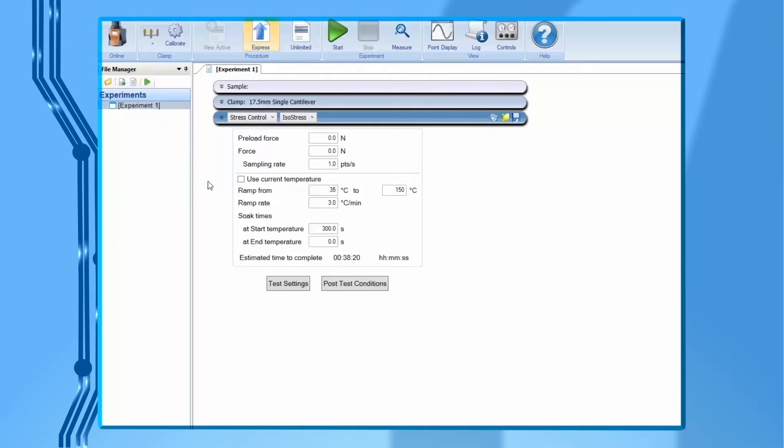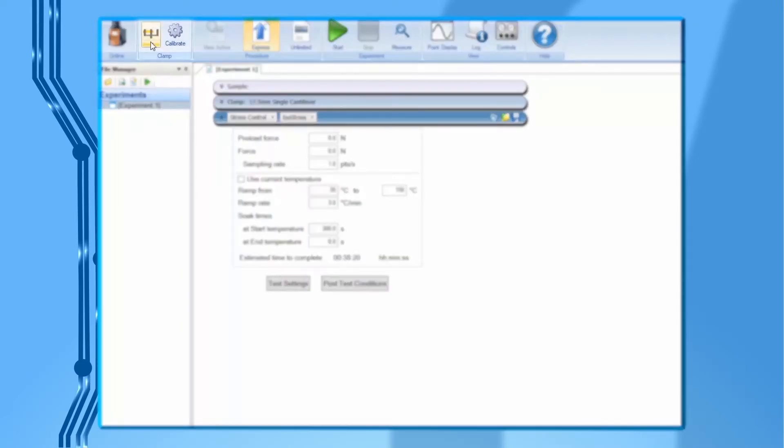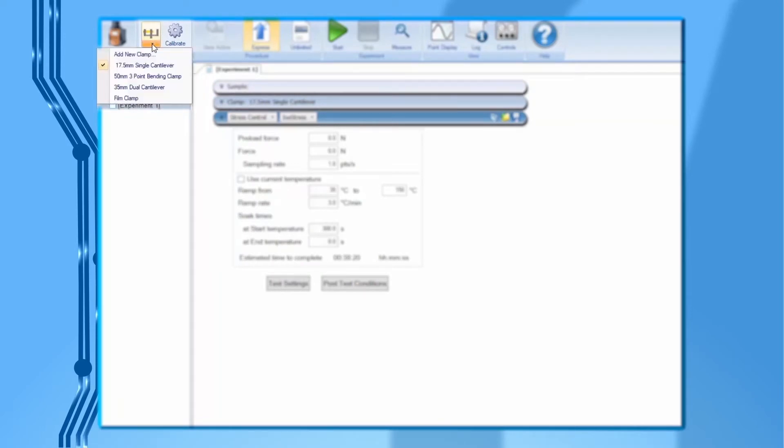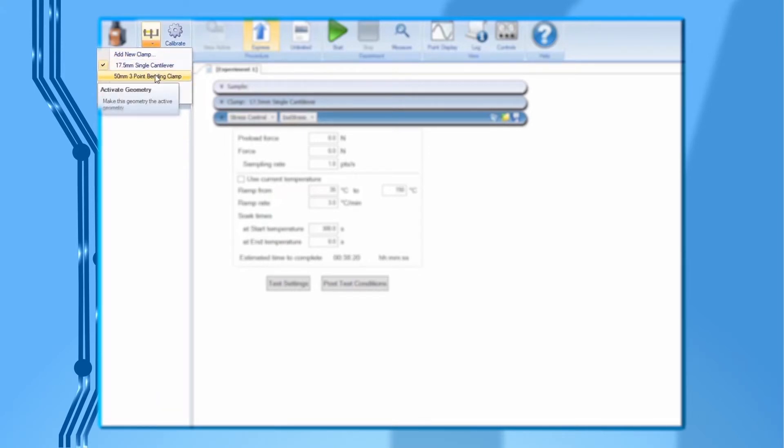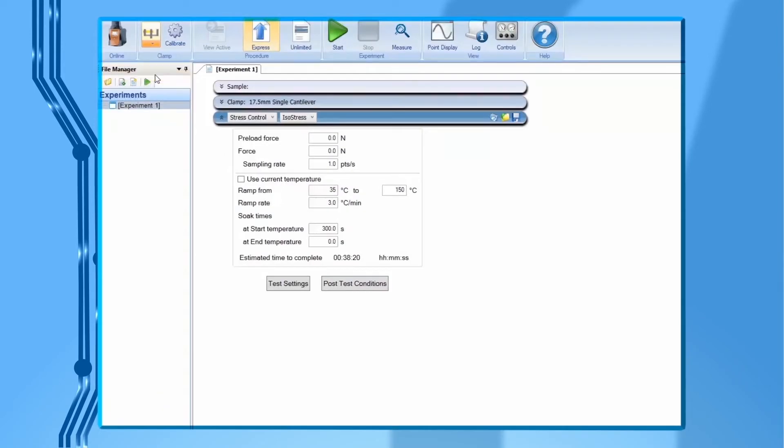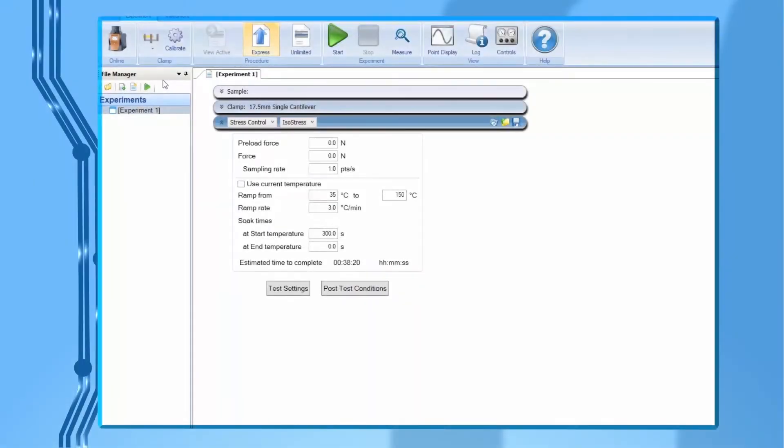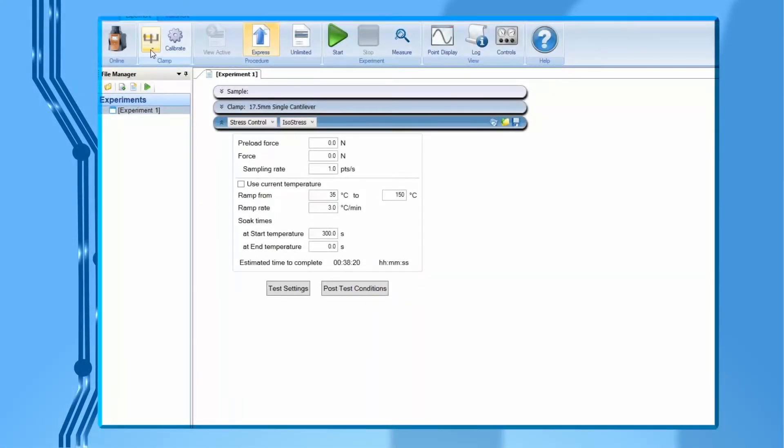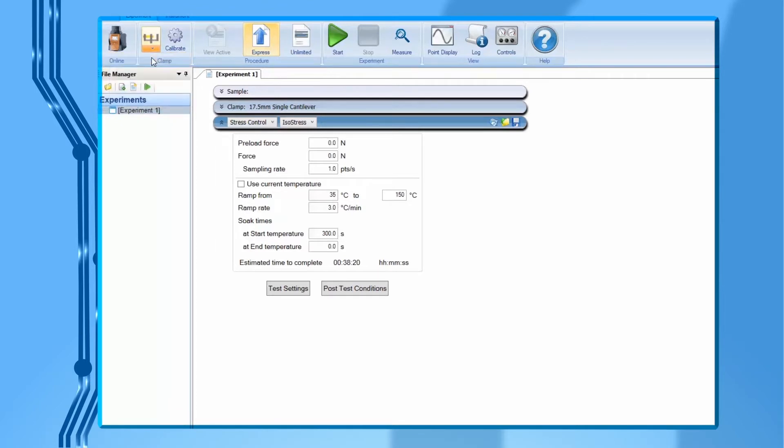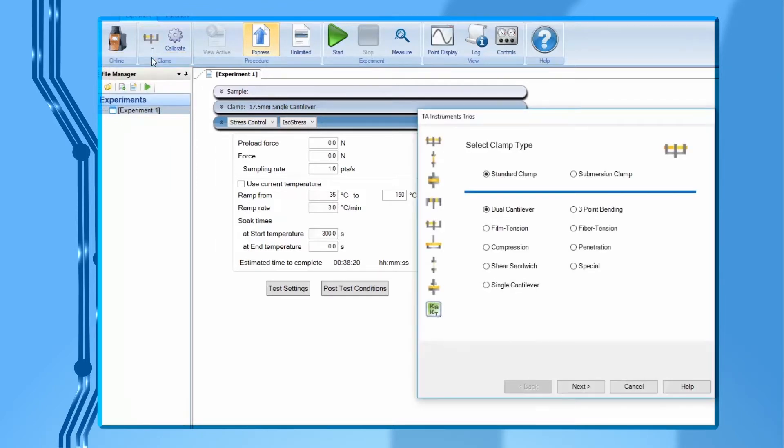Open TRIO software and connect it to a DMA850. Under experiment, click on the arrow on the clamp icon. Select the name of the clamp you want to install and calibrate. For example, 50 millimeter three-point bending clamp. If this clamp file has not been previously created, then click on add new clamp. Select three-point bending, then next.